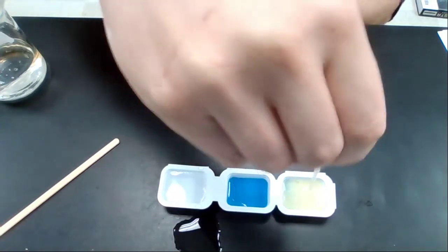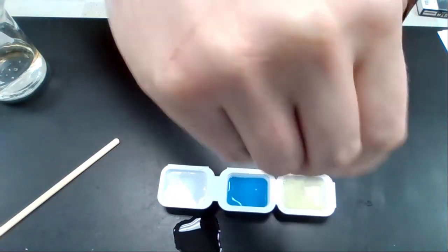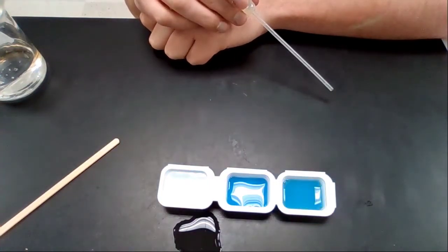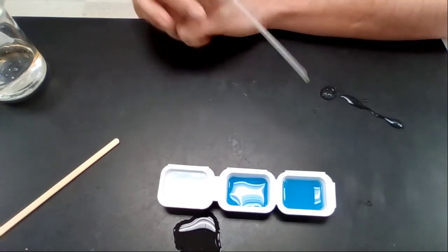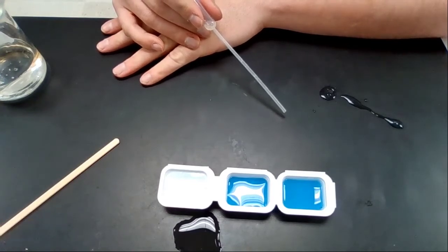And we're going to stir quickly. So think about what's actually happening here, right? Think about what happens when the pH changes, and then notice what happens afterwards.